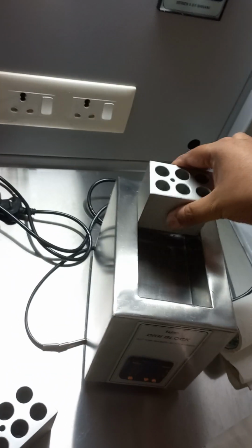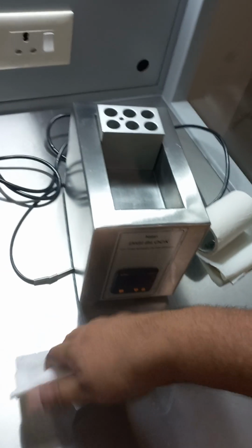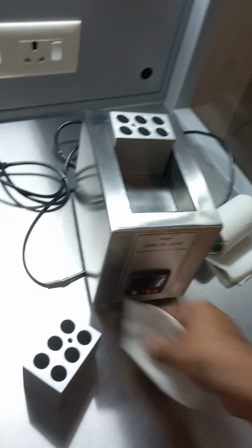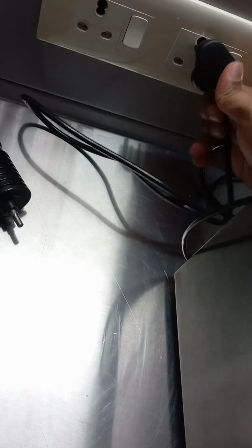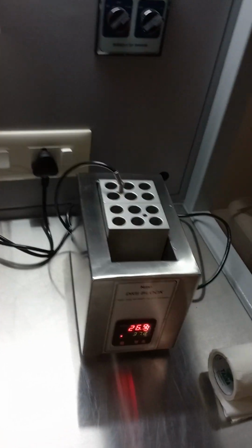So these are the heat blocks. These are going to keep all our test tubes nice and warm. Here you can see the test tubes being kept nice and warm. This is the sensor which we are placing inside. At the end of this we will plug it and see whether it works or not after our cleanup. And as you can see, it works very nicely. We'll wait for it to reach the desired temperature as well.